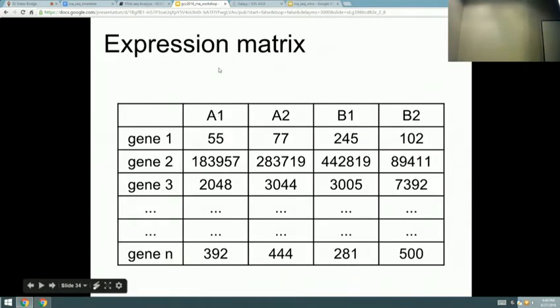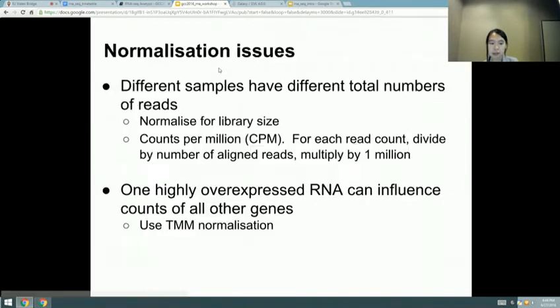So this is an example of an expression matrix. You have multiple genes, each row is a different gene, and you get numeric values. Usually you feed in something like this into DESeq or edgeR or one of these count-based methods. It's kind of hard to visualize how it is different just looking at these numbers. The first step would possibly be that we do a statistical test to look at differentially expressed genes.